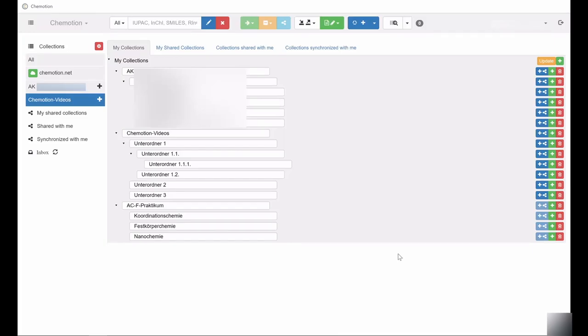Please note, to save any changes in the collection menu, you must click the yellow Update button after completing your modifications.